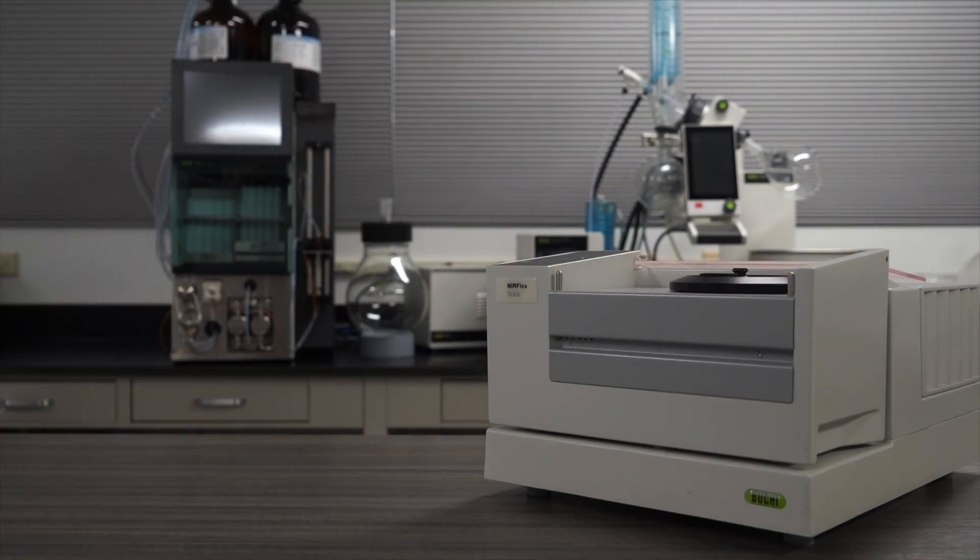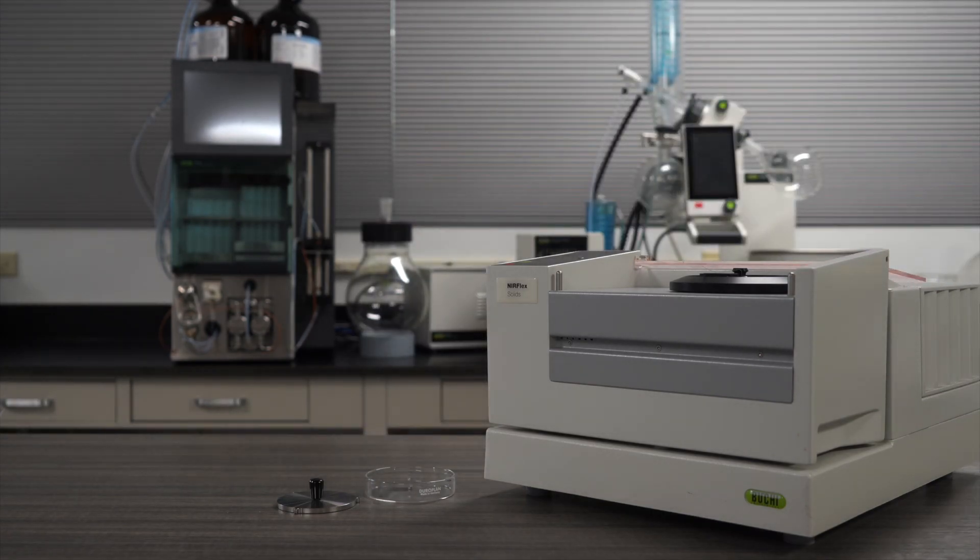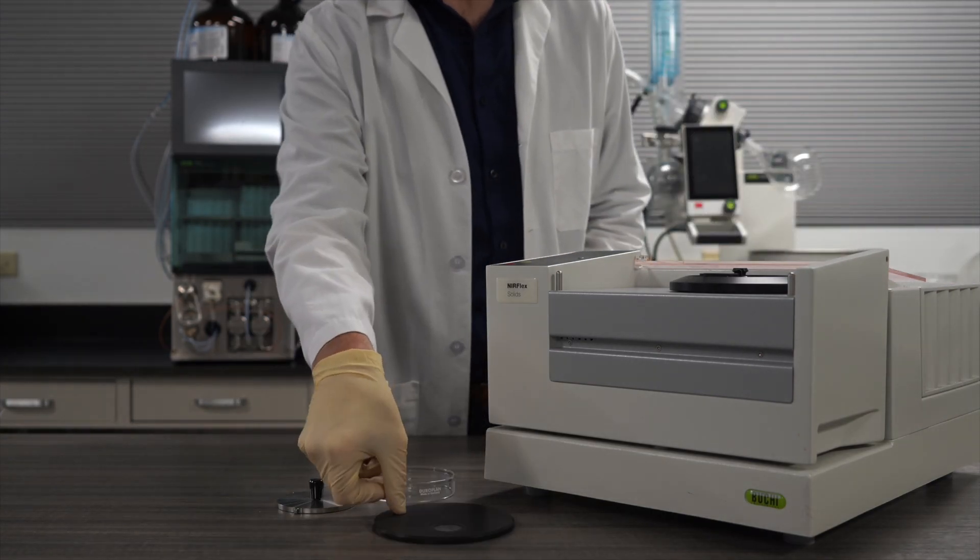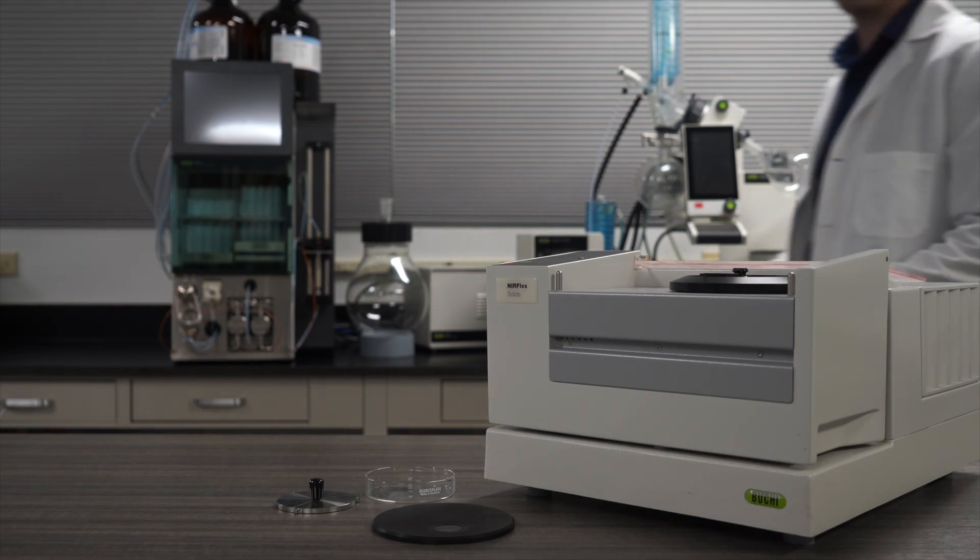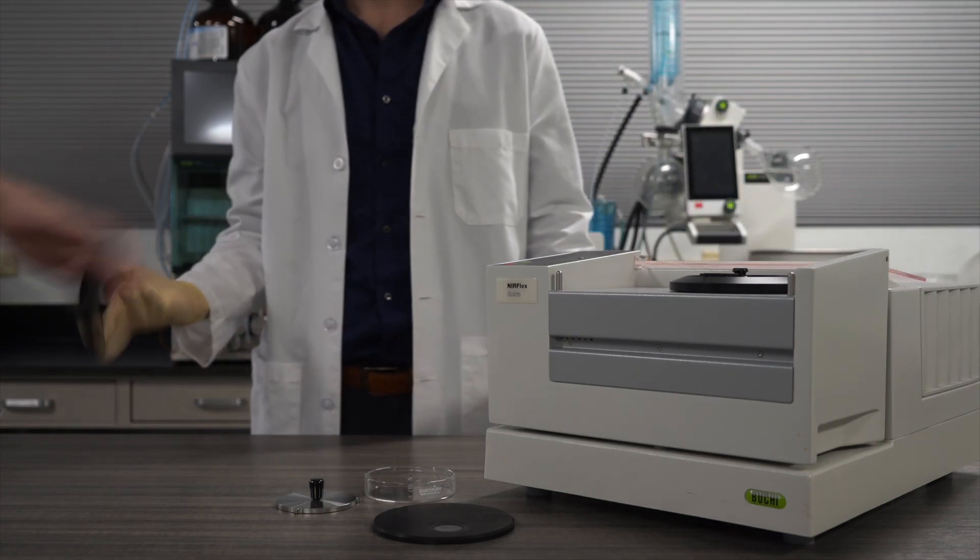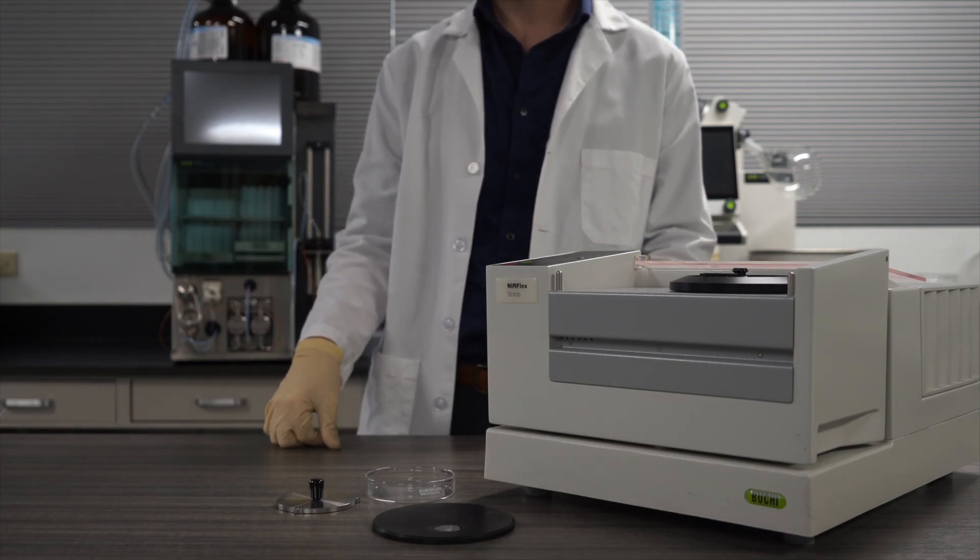The solids module offers a wealth of add-on accessories to make the measurement process as simple and accurate as possible. There are several types of dishes, one of which is the robust cup, which can survive accident-prone colleagues and are designed to be used in glass-restricted areas.